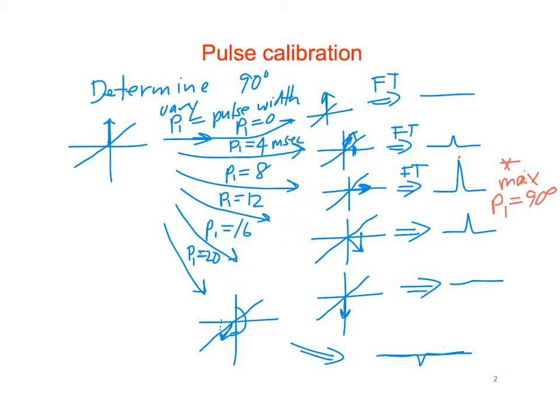So the top here is difficult to find, right? You'd have to do a very fine time gradient to get enough data points to find the top. So what would be another way you could do this, instead of finding the top, that would be an easier place to find?